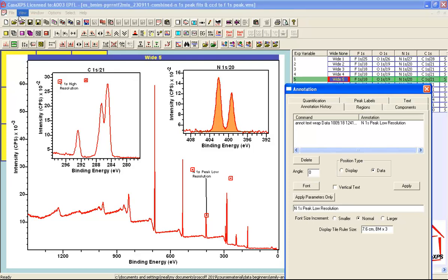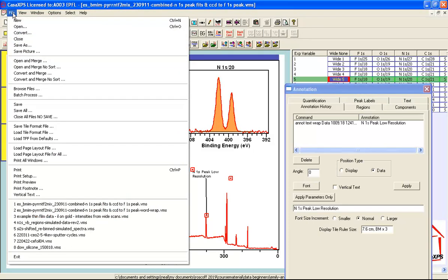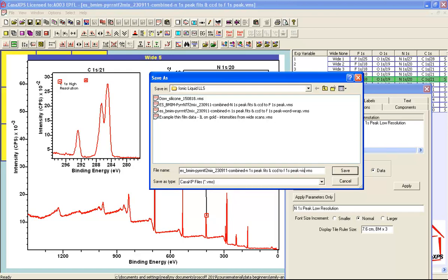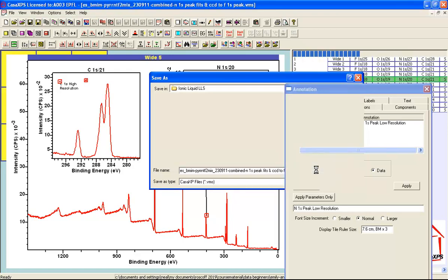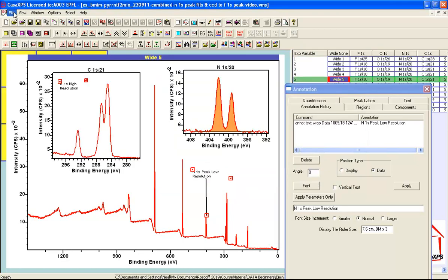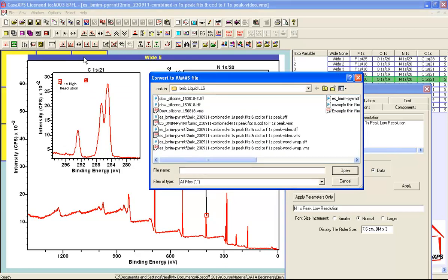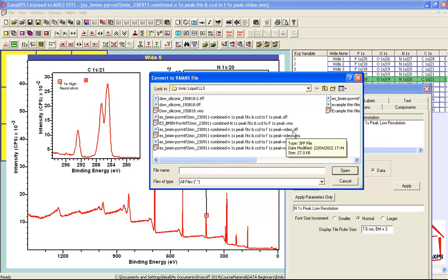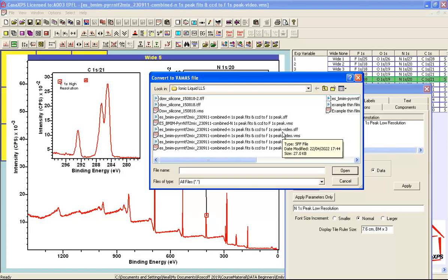Then finally I will save the VAMAS file. When I say save as, let me just give it a slightly different name, I save the file and if I look now I see the file that I just saved is this VAMAS file here. And then there's another file that is an SFF file and this is a saved tile format file that describes the display at the point when I save the VAMAS file.